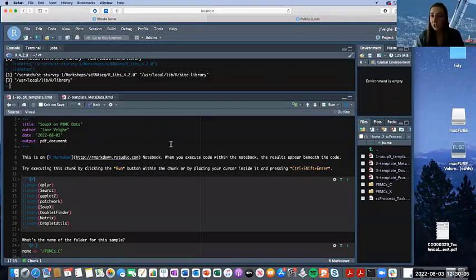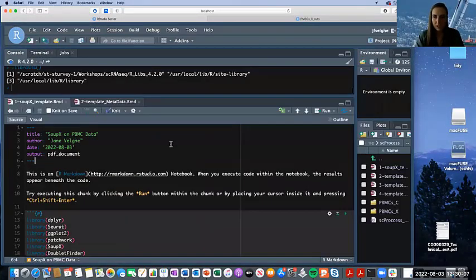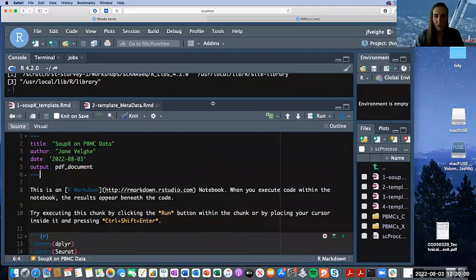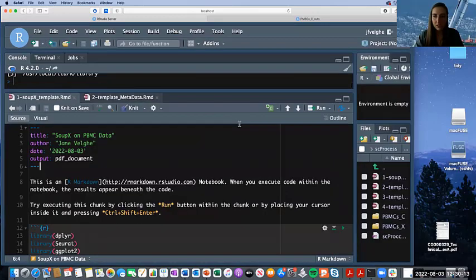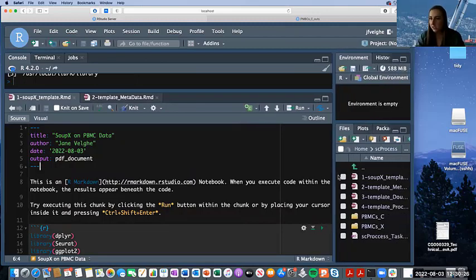Okay, so you should see me on RStudio now. It's going to increase the size of everything. Is that too much? It seems to take up a lot of space. That's good. Okay, in person, we're good. Online, what do you guys think? Seems okay. Okay, we've increased it a bit. I'll watch the chat in case I need to increase it a little bit more.